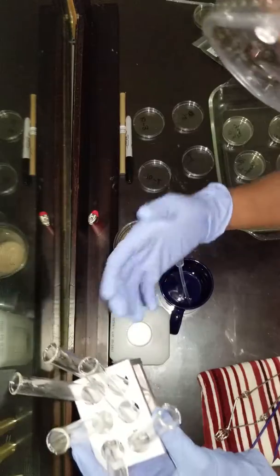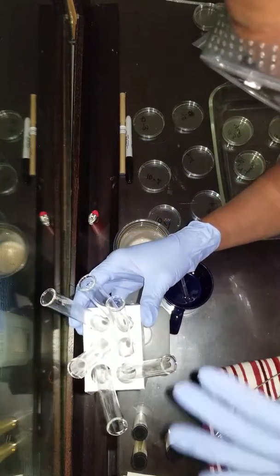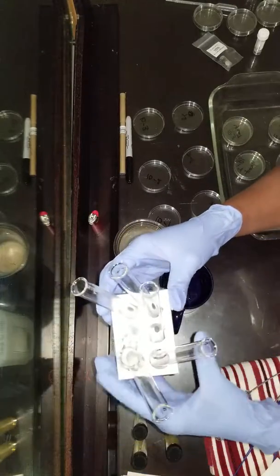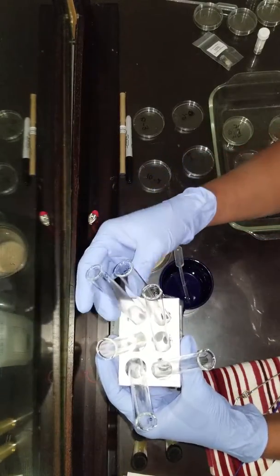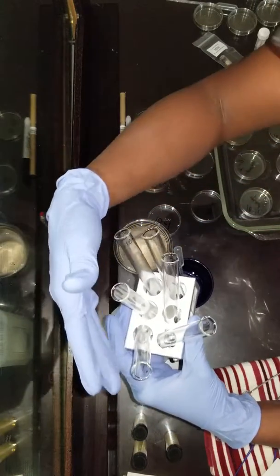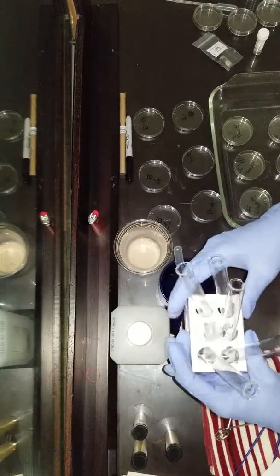So in other words, what they're trying to get us to do is to work with a gradation of concentration of the yeast solution. 10^-1 would be highly concentrated, 10^-2 less, 10^-3 less still. So the higher the number, the lower the concentration.